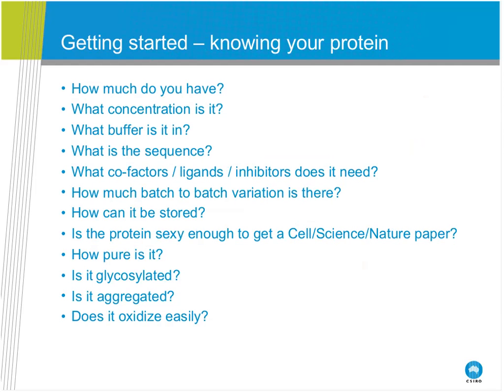So when we start a crystallization experiment, we've either spent time making protein ourselves, or we have got that protein from somebody else who has spent a lot of time. The important thing is to get as much information about that protein into your headspace, from either yourself, from your purification, or from the person who did it. And these are a list of questions that I thought of really quickly. There's probably more you can think of. Let's step through some of these in a little bit more detail.